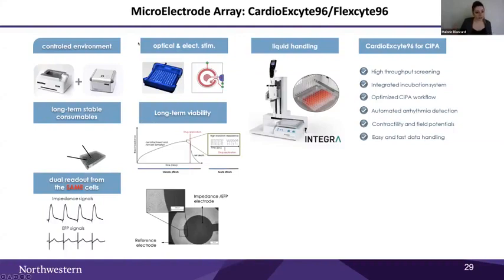You have the option to do optical or electrical stimulation. That's something I've used, and I will show you later on. There is also a liquid handling system if you want to use it. And I guess here it was to tell you that, at the same time, on the same cells, you can record the impedance signal and the EFP. So it's a really cool machine.